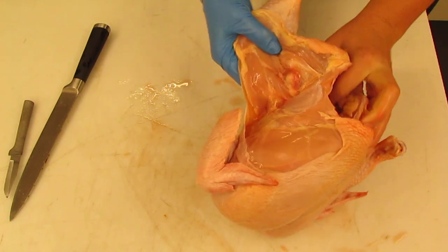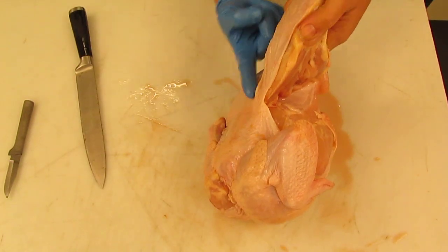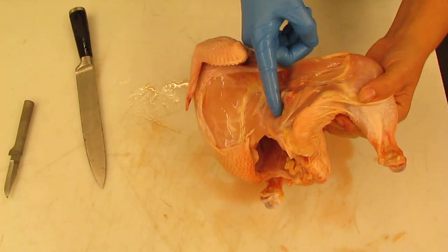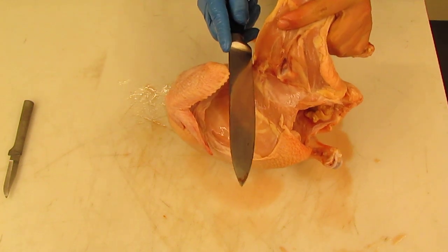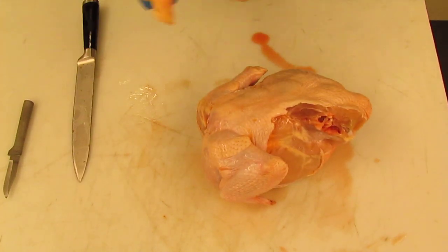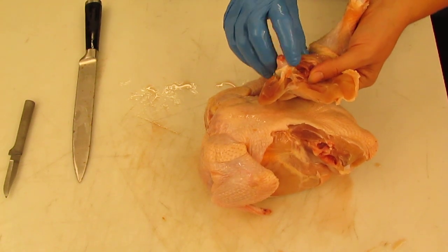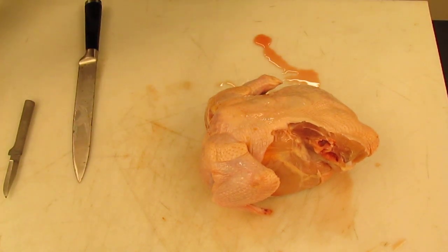Okay, now I want to essentially just cut the rest of the leg away. I will not have to cut through any bone because, again, I have just separated the femur from the rest of the hip. All right, so cutting through that joint. All right, it's nice and smooth. Here is where the hip was, and here is what I was actually feeling when I was playing with the hip before. The head of the femur, that was the hip joint, right? A nice smooth attachment site for a series of muscles.